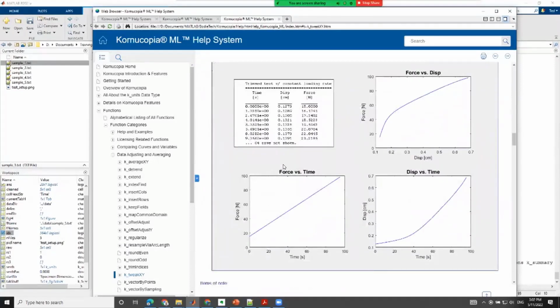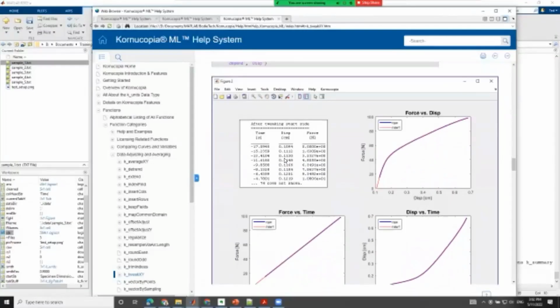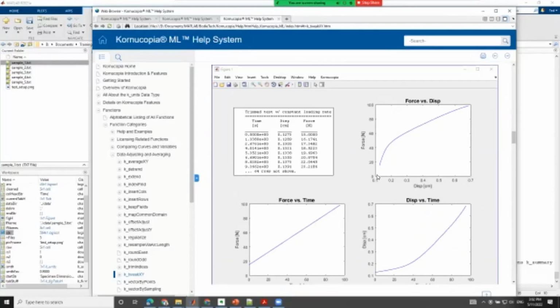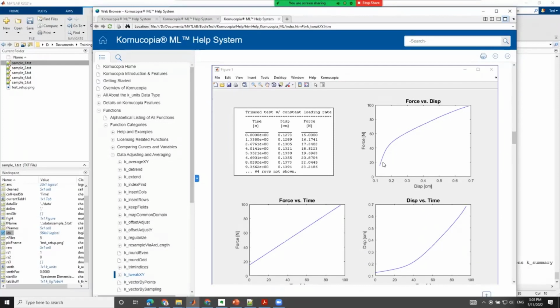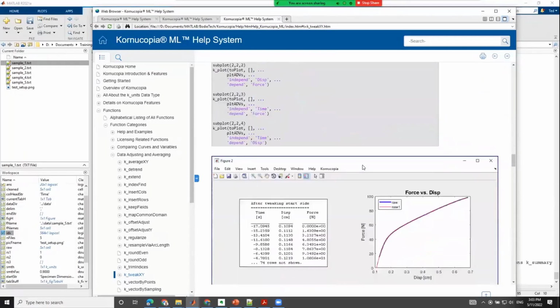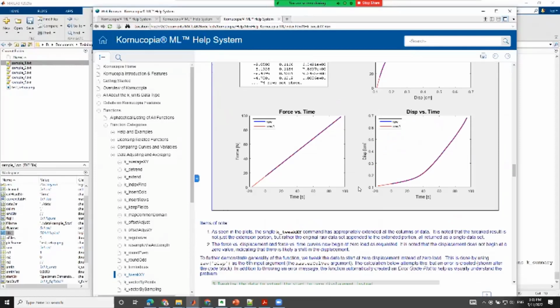And what these examples show is you can take a function like that, like data set this that was trimmed and is short, and you can tell it to grab a portion of the data and then curve fit it linearly or with a nonlinear polynomial and back extrapolate to either like the force is 0 or the displacement is 0. You have control over this. And you can take data sets like that and effectively heal them to make them be fixed or cured.